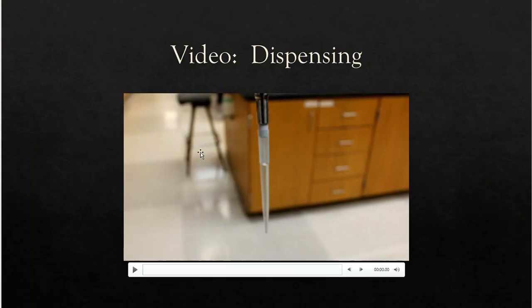All right, so here's another video I'd like for you to watch, and it's me sucking up and dispensing a liquid using the micropipetter.